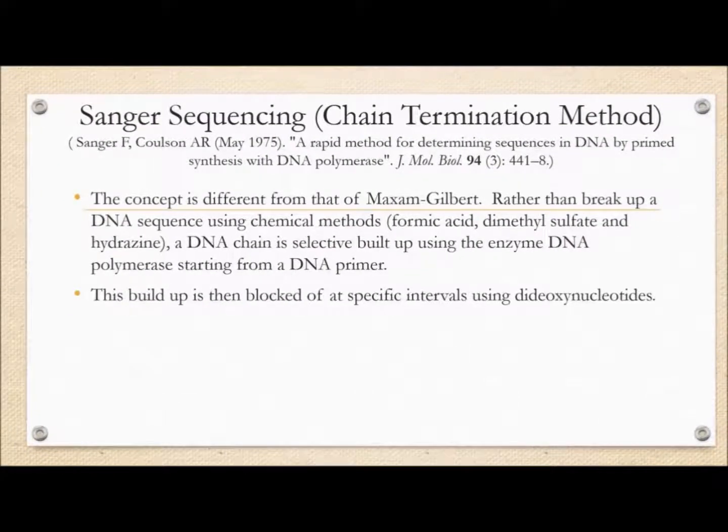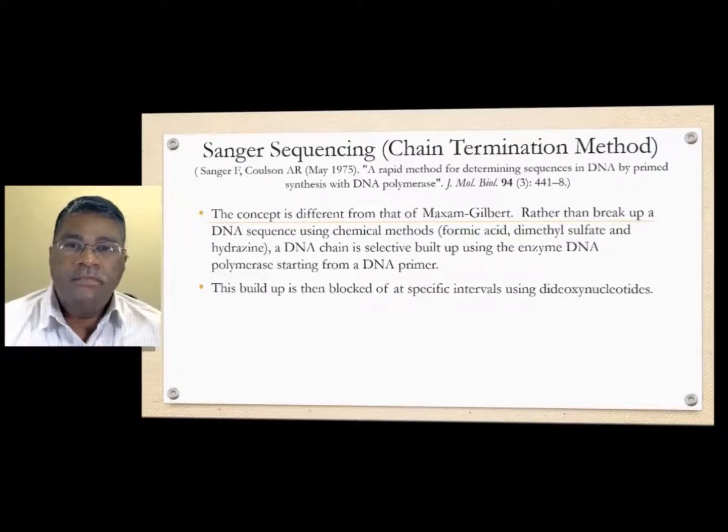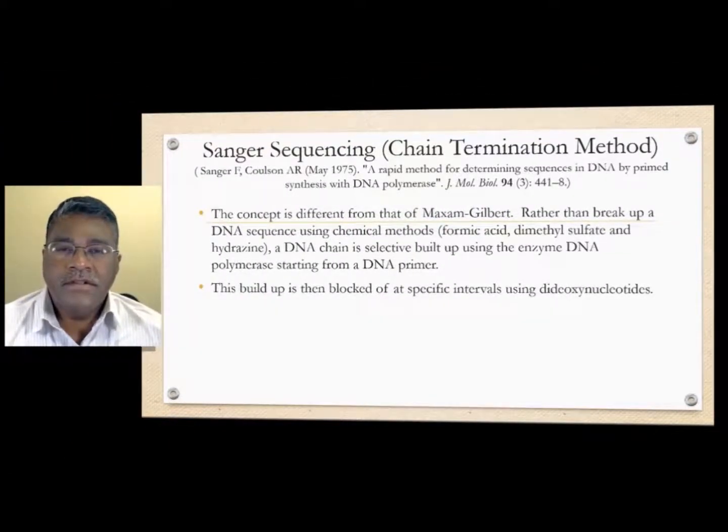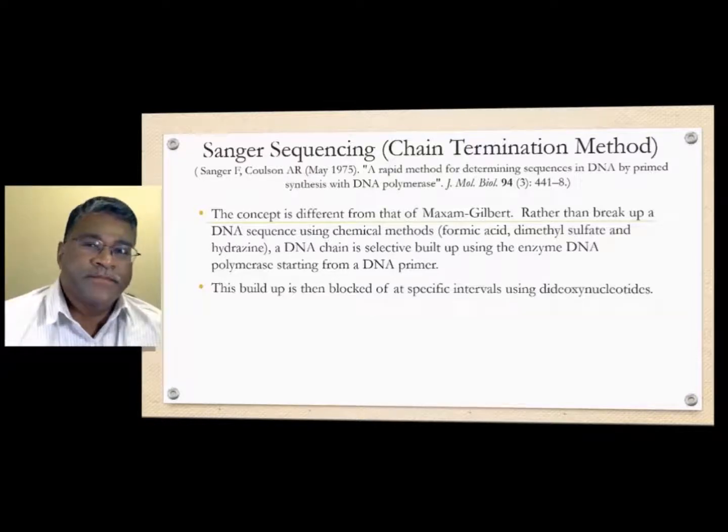So, using the primer and using DNA polymerase, you are building your DNA, which is complementary to the sample that you're trying to sequence. Okay.